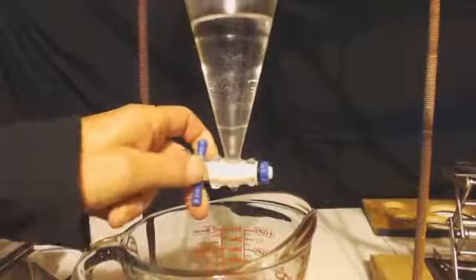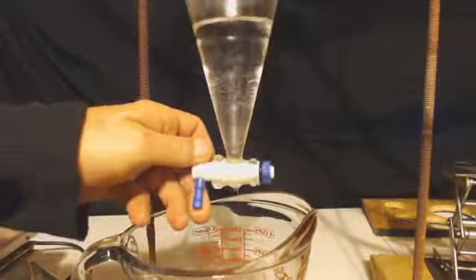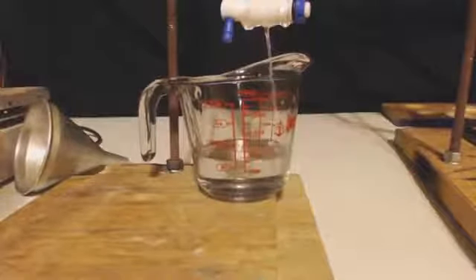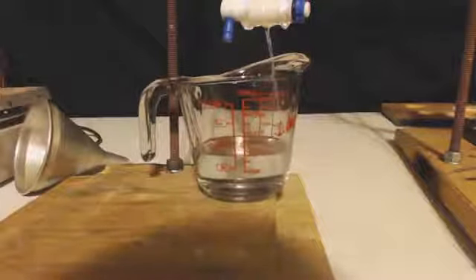Yeah, you can see how clear. I actually let that sit for hours to get it like that. Get that bottom layer out. Now I got pure toluene up on top. Let's see how much there is. It's about 95 milliliters there.